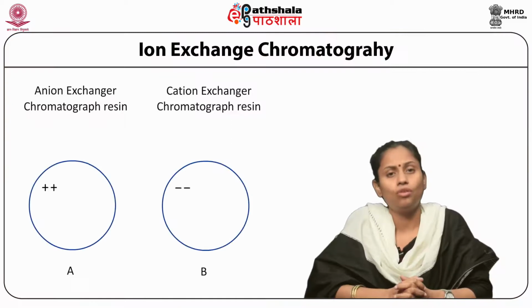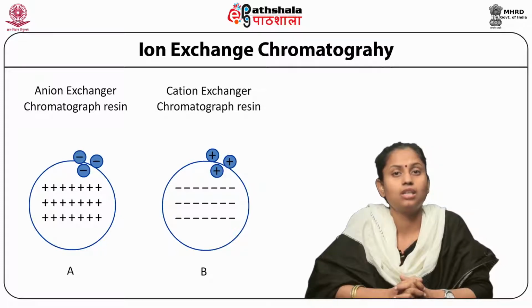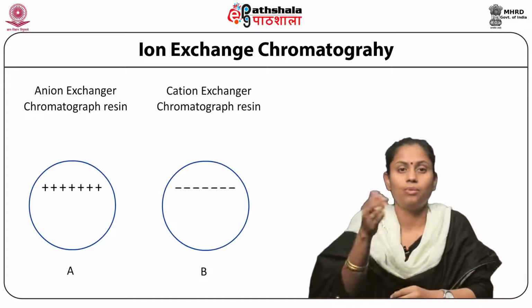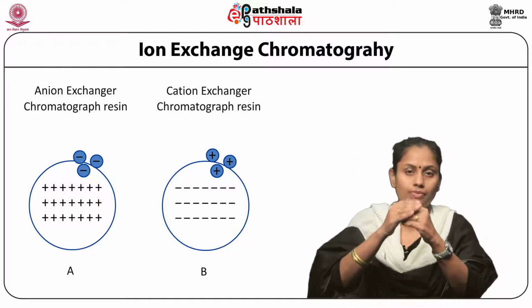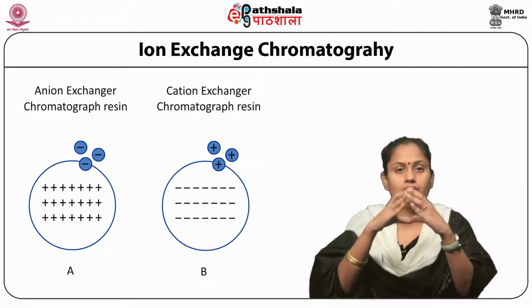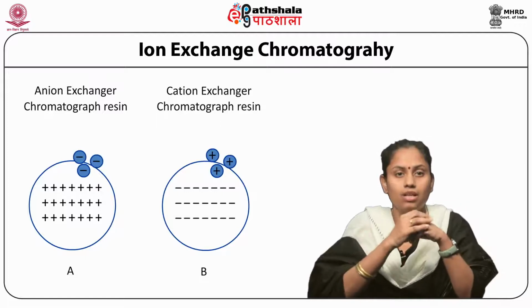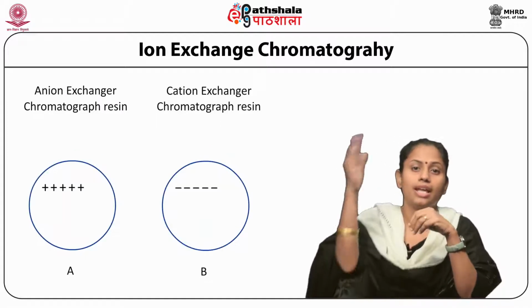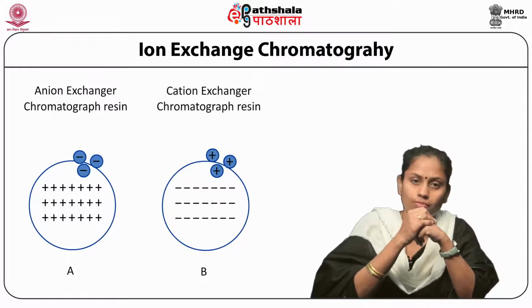Now, these features are used in purification protocols, from microscale purification and analysis to purification of products in very large quantities. The following figure represents a pictorial representation of the charged stationary phase where the oppositely charged ions are adsorbed. In figure A, we see a positively charged matrix of resin where the negatively charged ions of the compounds are adsorbed.